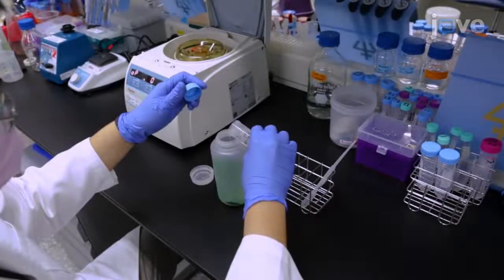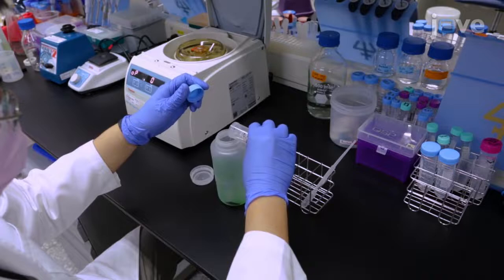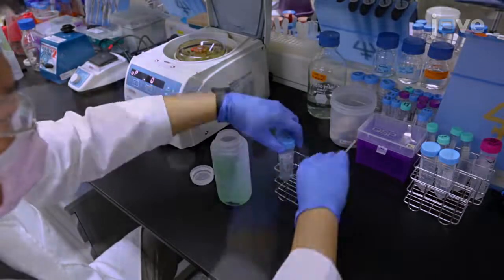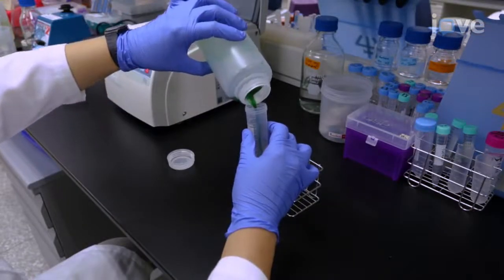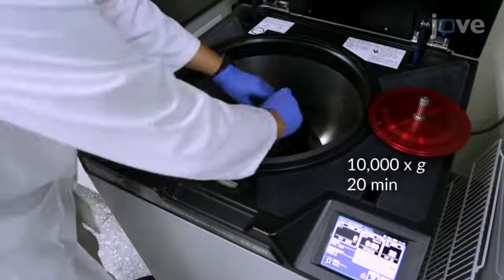Suspend the cell pellets and wash twice with 0.75 molar potassium phosphate buffer, pH 7. Pellet the cells in a 50 mL centrifuge tube by centrifugation at room temperature.